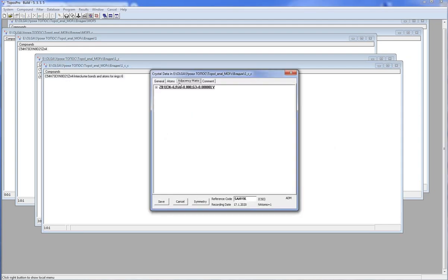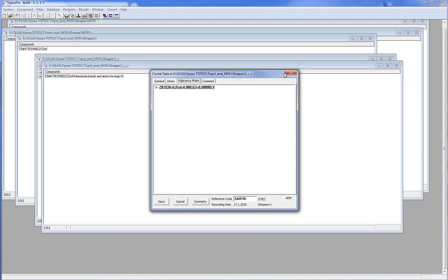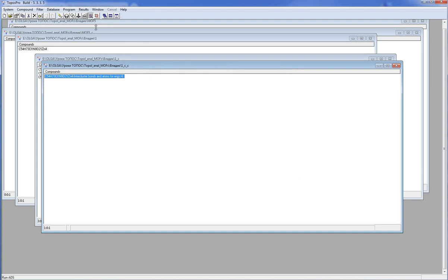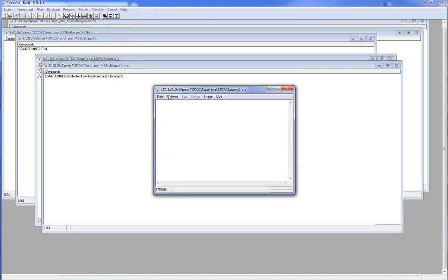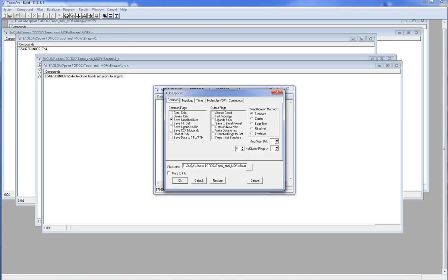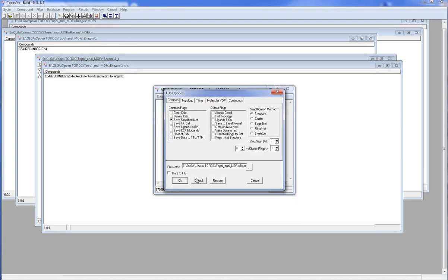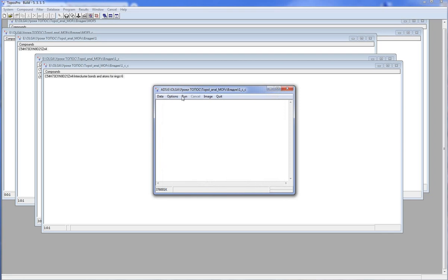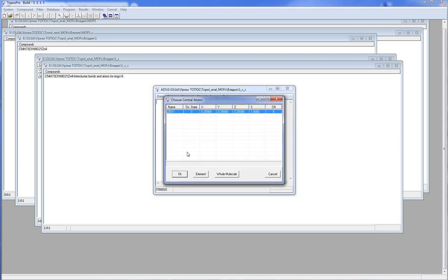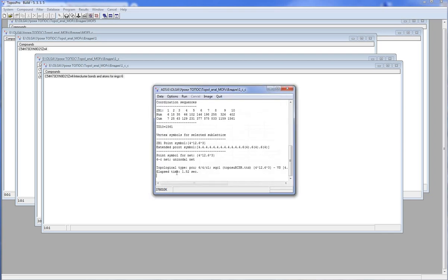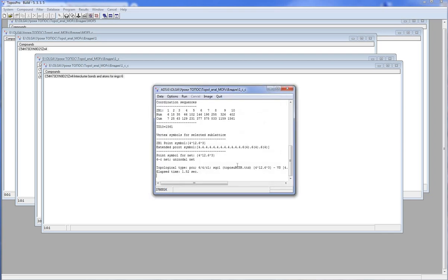I click ADS, Options, Topology, Default. Here we have a PCU network. This is another representation of the same structure.